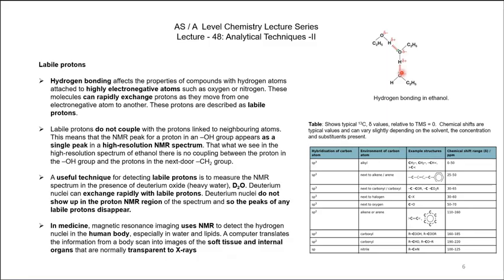So how to look at whether this hydrogen is labile hydrogen or the hydrogen of the ethyl or methyl group or aryl group. That's what we are looking for then. So we have to distinguish between labile proton and the proton in the molecule.